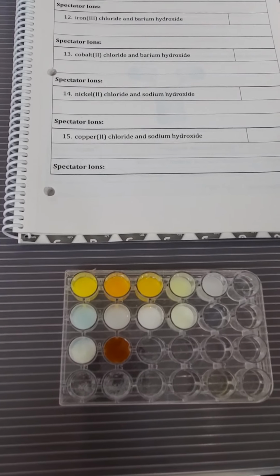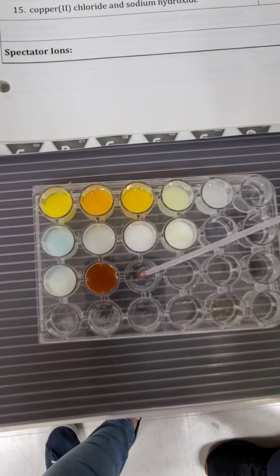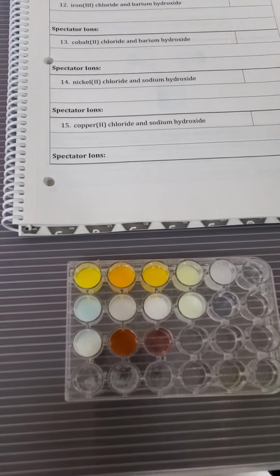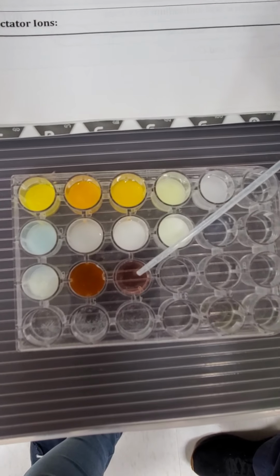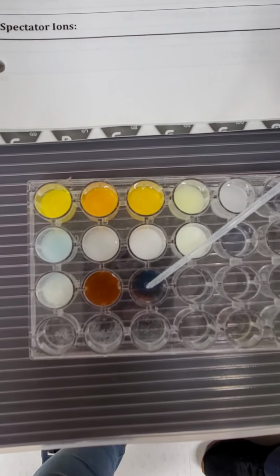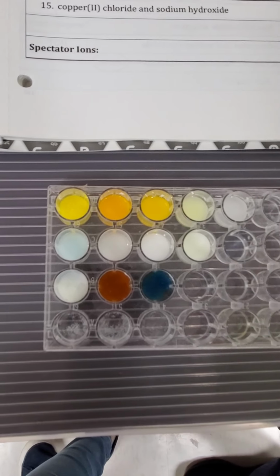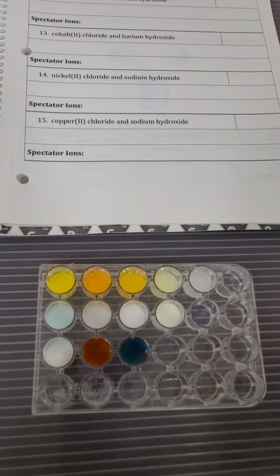And now we have cobalt 2 chloride. And barium hydroxide again. Barium is one of the few hydroxides that's well behaved, and notice when it's not with barium, things tend to happen. Nickel 2 chloride.